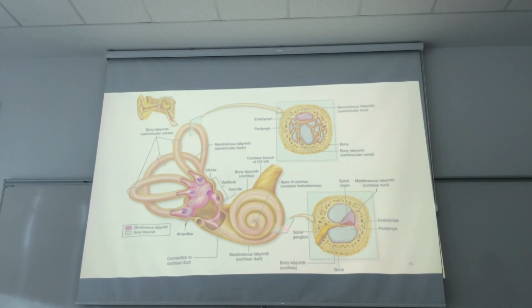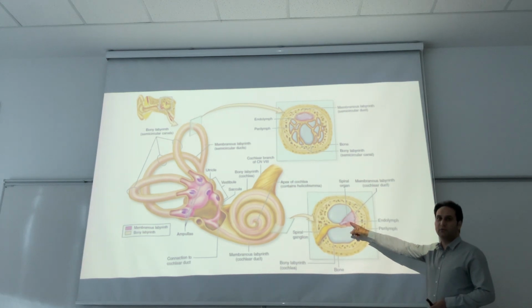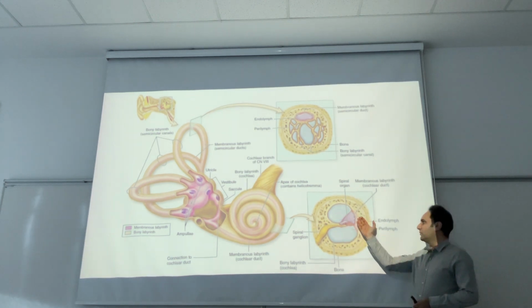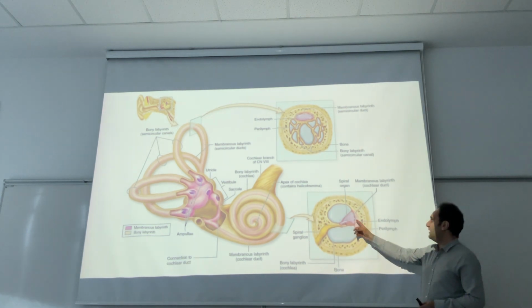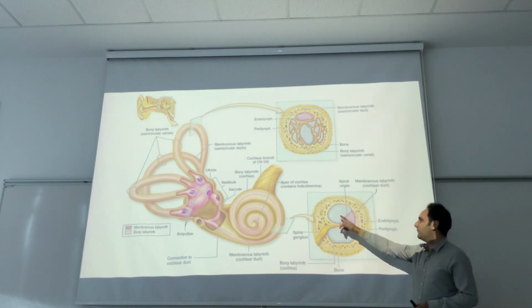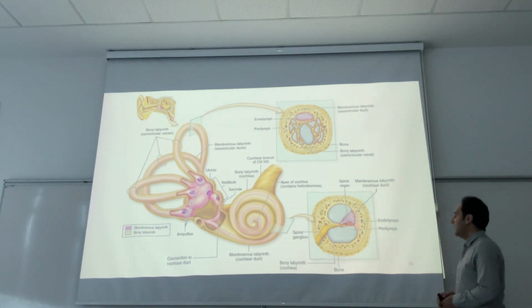When we cut the cochlea and look at it in this part, again we can see the bony labyrinth. In the inner side of the bony labyrinth, we can see this structure, this pink area. This area is our membranous labyrinth. The bony and membranous labyrinth form this structure in the inner side of the cochlea: three different cavities. Here is our cochlear cavity or middle cavity filled with endolymph, but these two cavities are filled with perilymph. Okay, perilymph. We will talk about these cavities and structures.